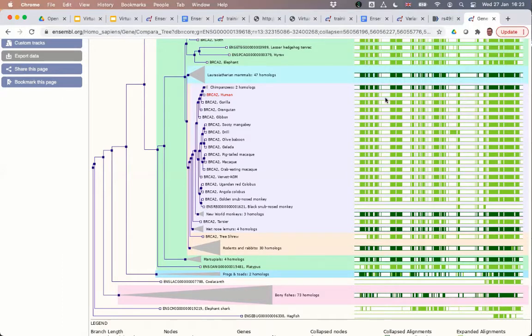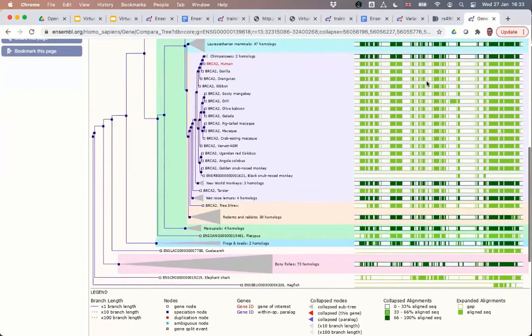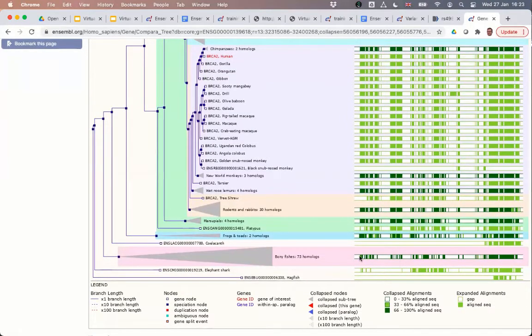Where we have branches of the tree that are hidden by funnels, we have this protein representation that's filled with light green, dark green, and white. Here it's a single protein that's meant to represent all of the bony fishes in this case.